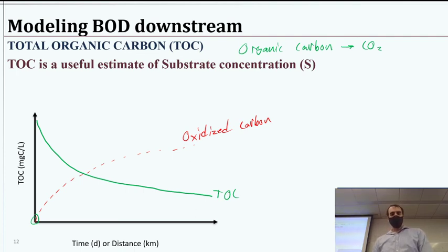Okay, so that gives you a picture. And by the way, this TOC measurement just takes a matter of 30 or 40 minutes, something like that. It's relatively quick compared to the 5 days it takes to measure the BOD 5.